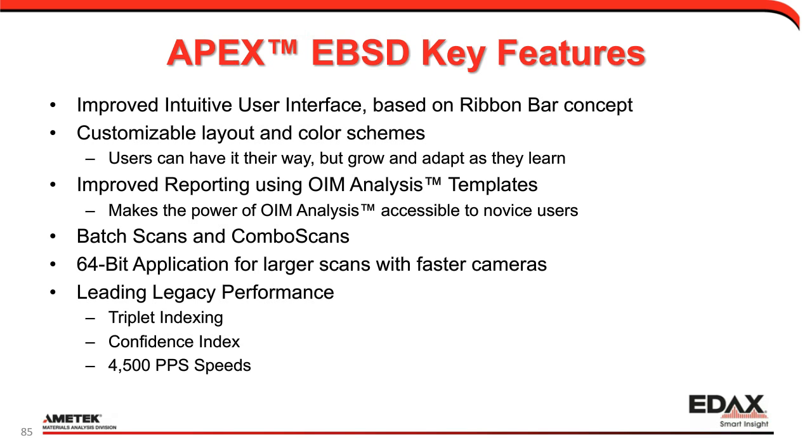APEX EBSD. Again, it's an exciting new data collection product. We think it should bring a lot of what folks have asked for who have used both our legacy OIM DC and our TEAM products, and it brings them all together. Improved intuitive user interface using a ribbon bar, with customizable layout and color schemes. You can have it how you want it. It grows and adapts as you use it.